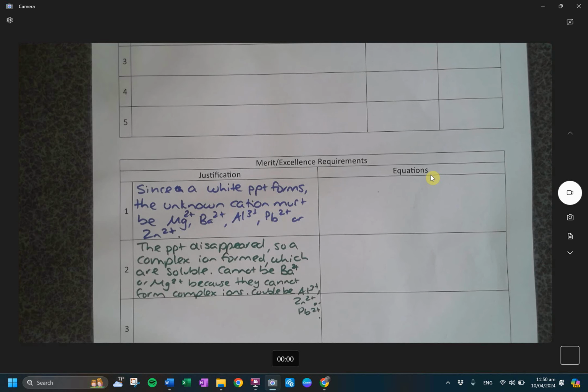Now, why is this not precipitating the way I want it to? I don't know. It should. I didn't give you guys zinc yesterday, and I currently don't have zinc right now. Why aren't you forming a precipitate? Oh, I can see why you guys misidentified it now. Adding quite a bit of ammonia to see if I get it precipitating. Oh, that is weird. It's not working. What are you doing? Oh. That is weird.